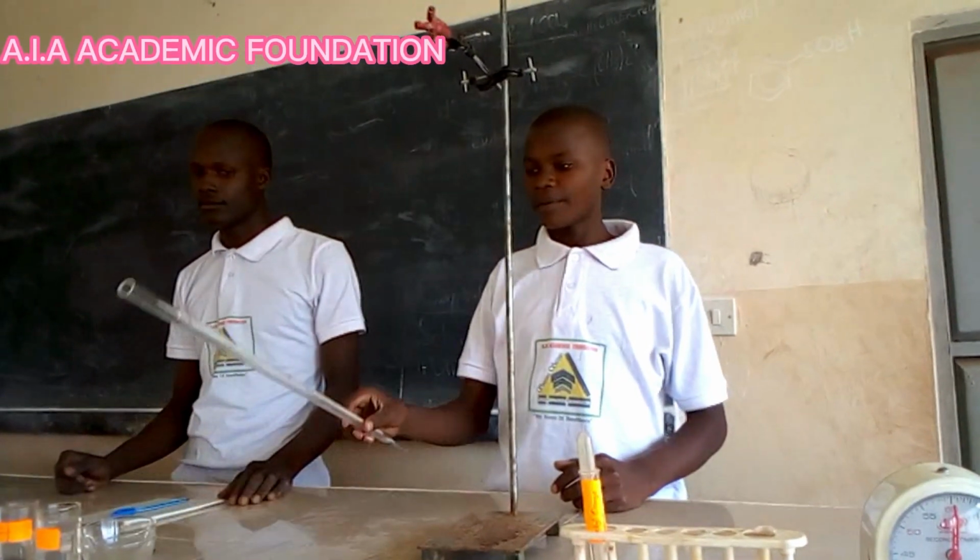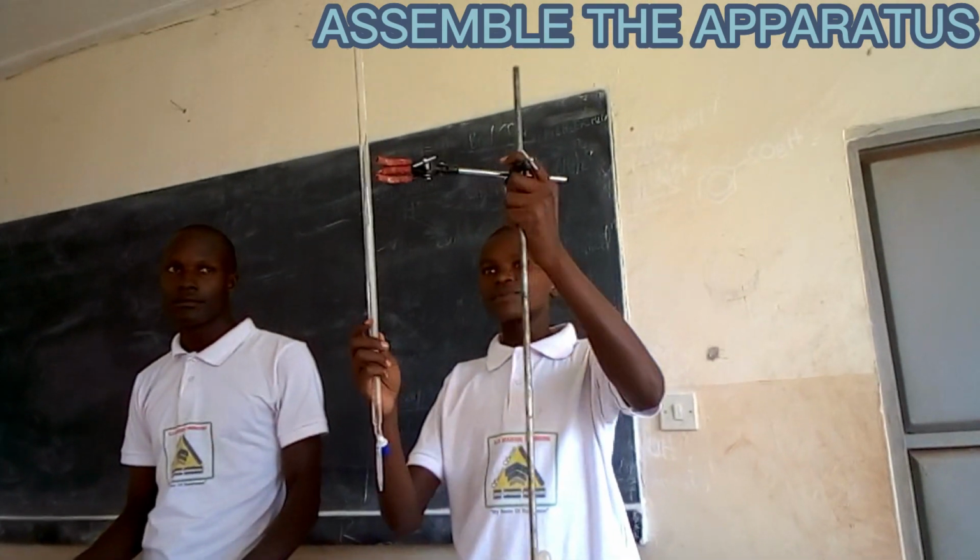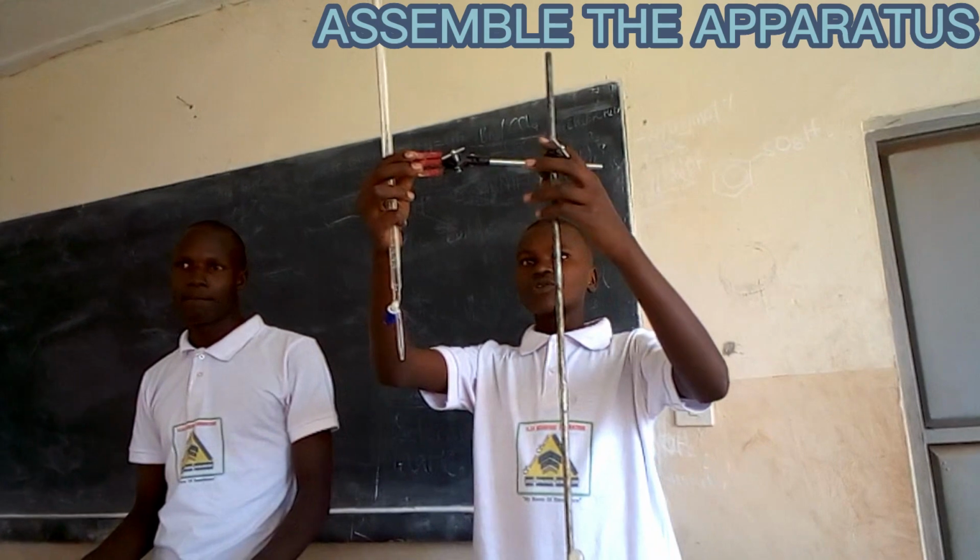I'll first assemble the apparatus accordingly. I'll first get ready and put it on the stand so that the solutions can go on well.